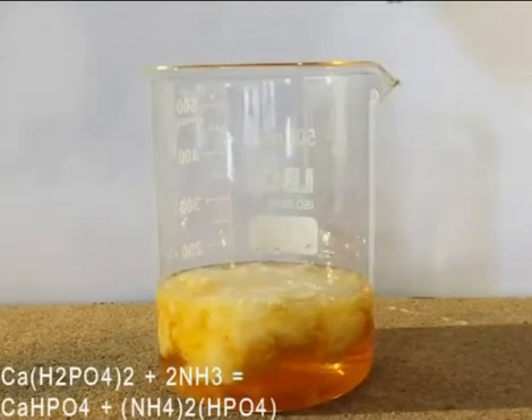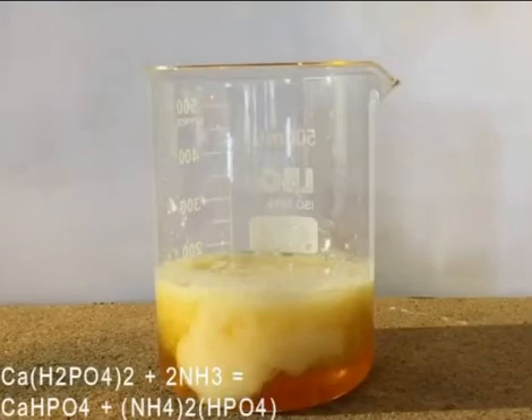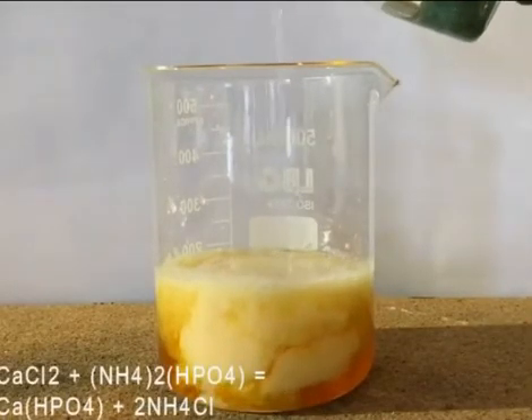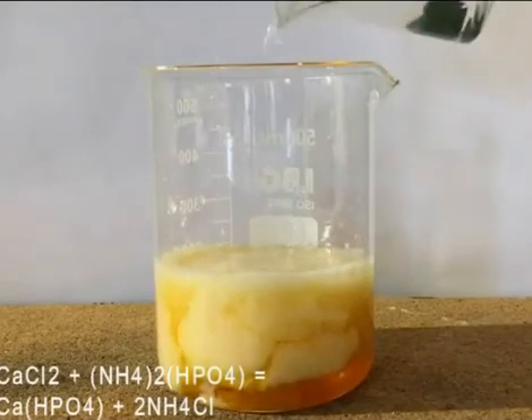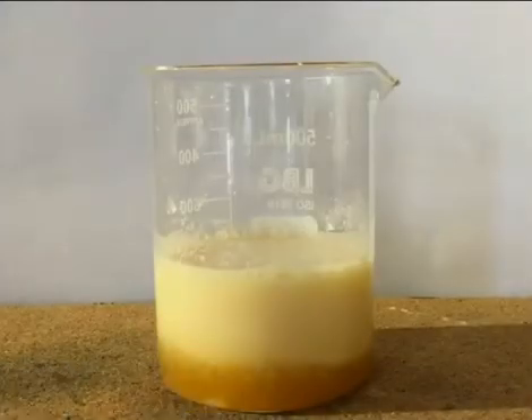After this, the ammonium phosphate reacts with the calcium chloride present to form more dicalcium phosphate. The product is then filtered and washed several times with water.